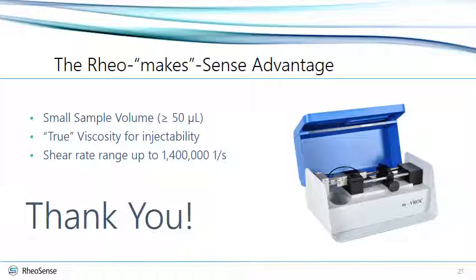For non-Newtonian fluids, this requires proper characterization of shear rate, since the viscosity depends on shear rate. And that proper shear rate is what we'll call true shear rate, that the fluid actually experiences inside the test chamber that you're using with your measuring method. Calculating that shear rate is more complex for non-Newtonian fluids than for Newtonian fluids.